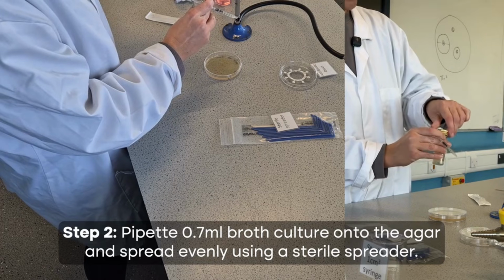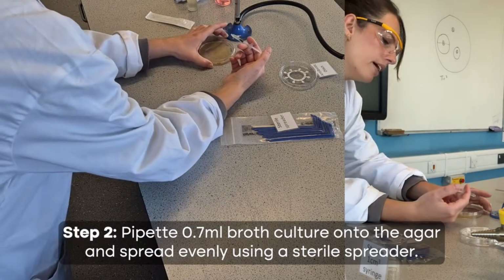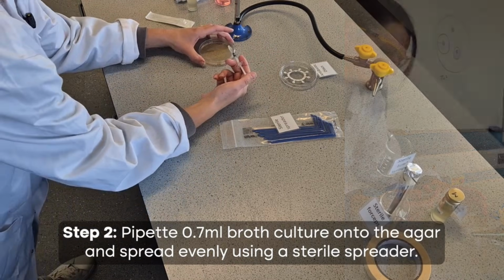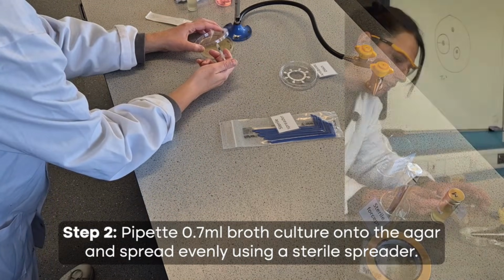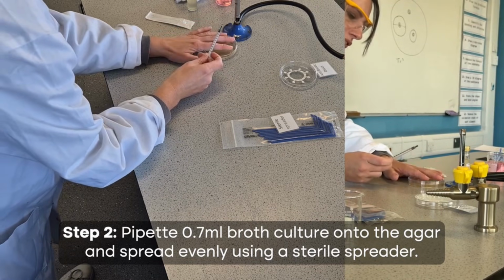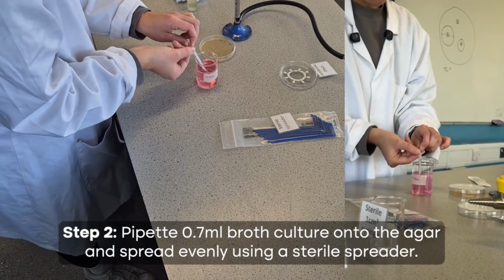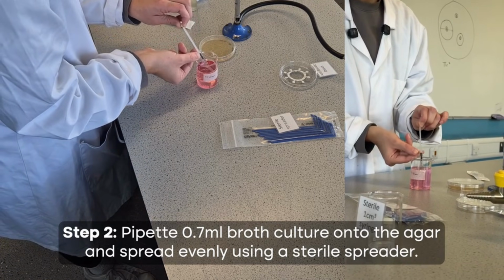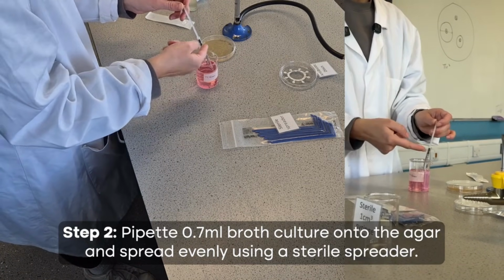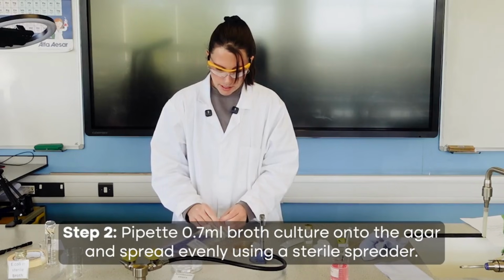I then put the lid on straight away so I can't accidentally knock over the bacteria. Working near the Bunsen burner, so we've got that convection current. Then I'm going to open it only slightly at an angle, put that bacteria onto the plate. I'm going to close it now, and before I spread it, put the syringe into the Virkon, but get your students to actually pull the syringe up so it draws the Virkon inside, so it's disinfecting the inside and the outside of your syringe.